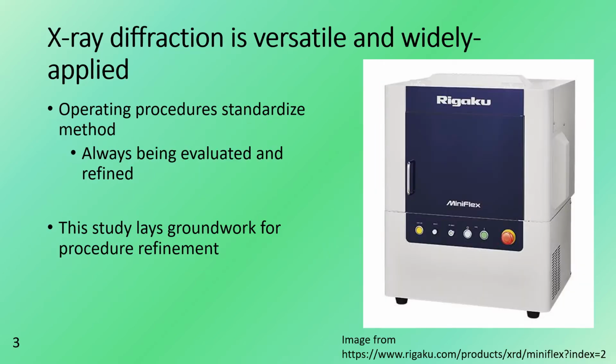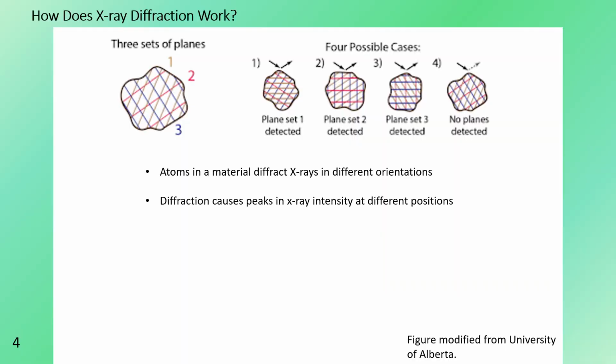So X-ray diffraction is versatile and widely applied. We're talking pharmaceuticals, geology, cement analysis, you name it. And operating procedures exist to standardize the methods for different instruments, materials, etc., for different labs, but they need to be evaluated and refined over time. And this study is meant to lay the groundwork for procedure refinement. I said developing, but it's more like refining an existing procedure.